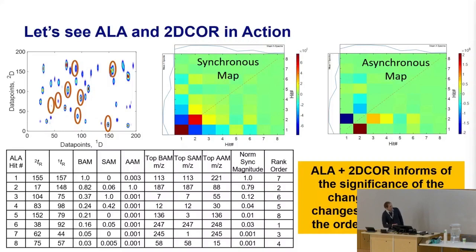What's interesting here, even though I controlled this data set, is that it was a little bit of guess and check. You just put the numbers in and keep generating the data set until you get a nice pretty answer, since it's all random. But the most important change is not the first one. Whenever we think about an explosive aging study or decomposition of pharmaceuticals, we might say, hey, that's a big change there, and statistically that might be the most important one, but it's not necessarily the first thing that happens.